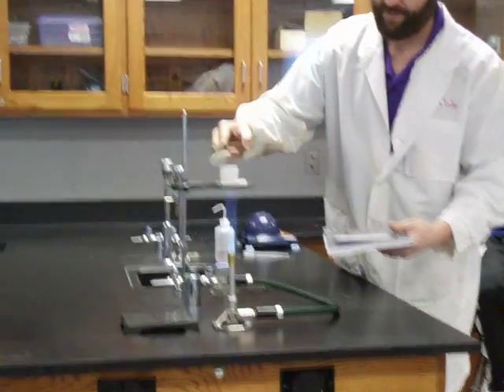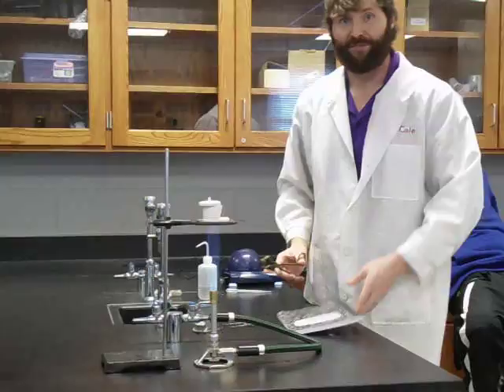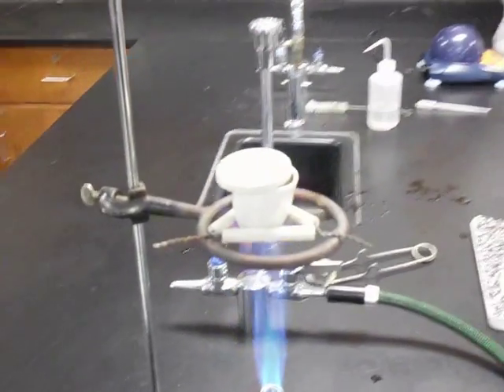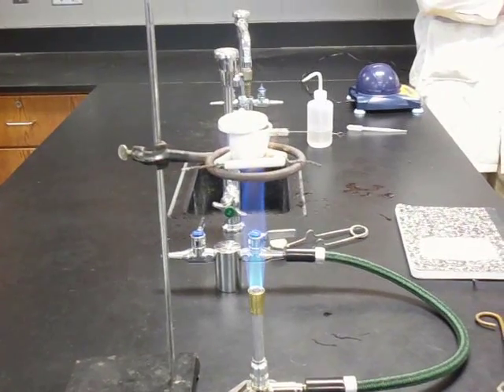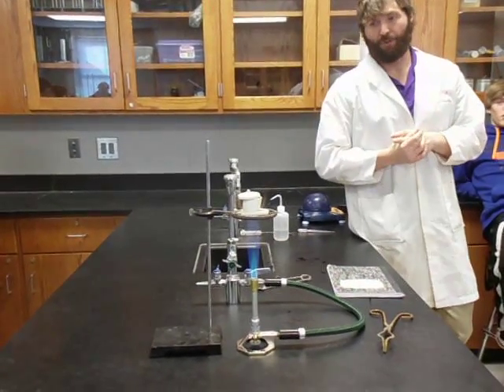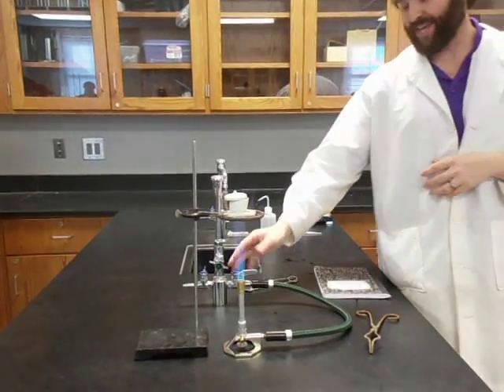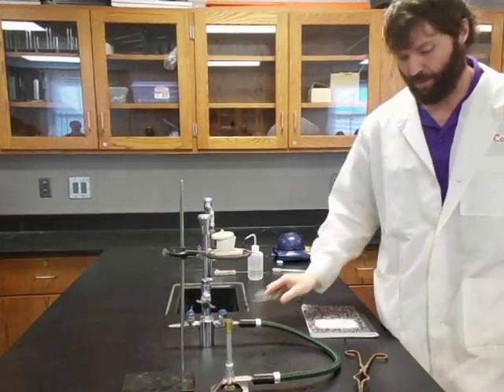Set it up in here and leave the lid cracked. Why do you think I've got the lid cracked on the crucible right now? I just got it wet — I want to dry it. So step number one: clean the crucible. Step number two: heat and dry the crucible. Probably about four minutes will be good. So let's heat and pretend it's been four minutes and this thing is good and dry.